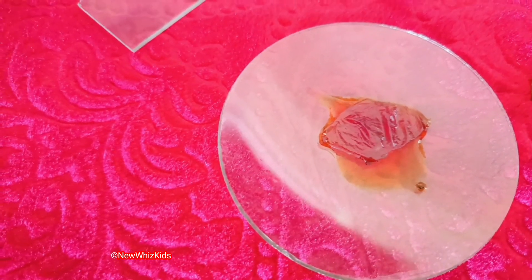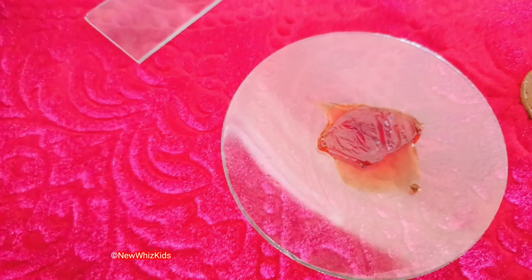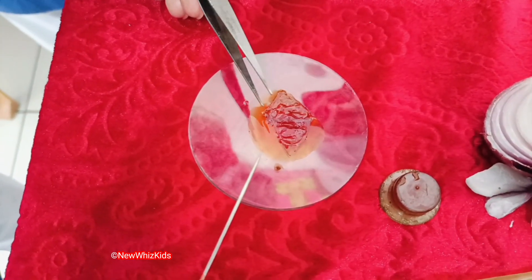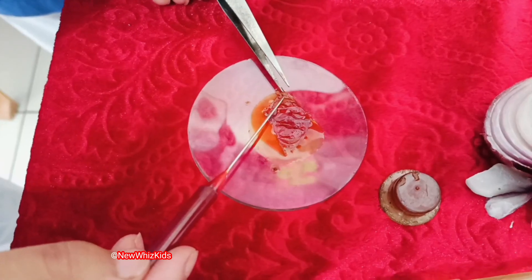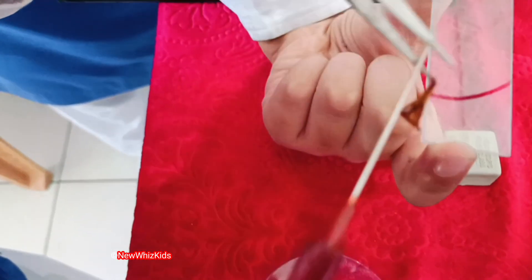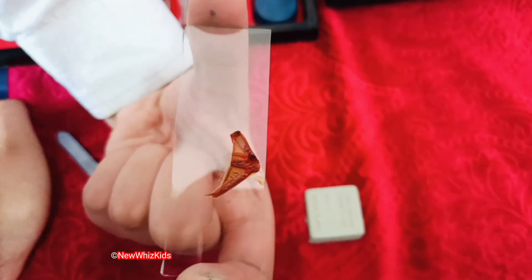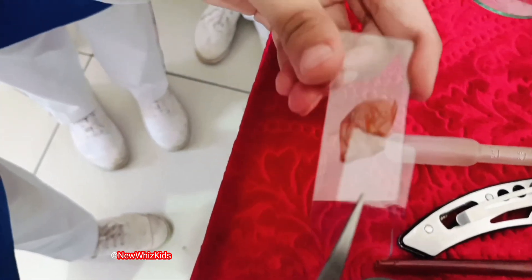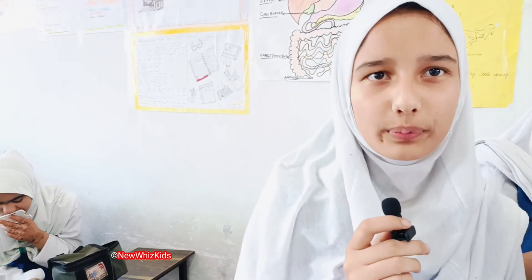Keep it there so that the sample gets stained properly. Using forceps and a spreading needle, take the stained sample carefully and mount it on the slide. Put a cover slip on the stained sample and observe it under a microscope.